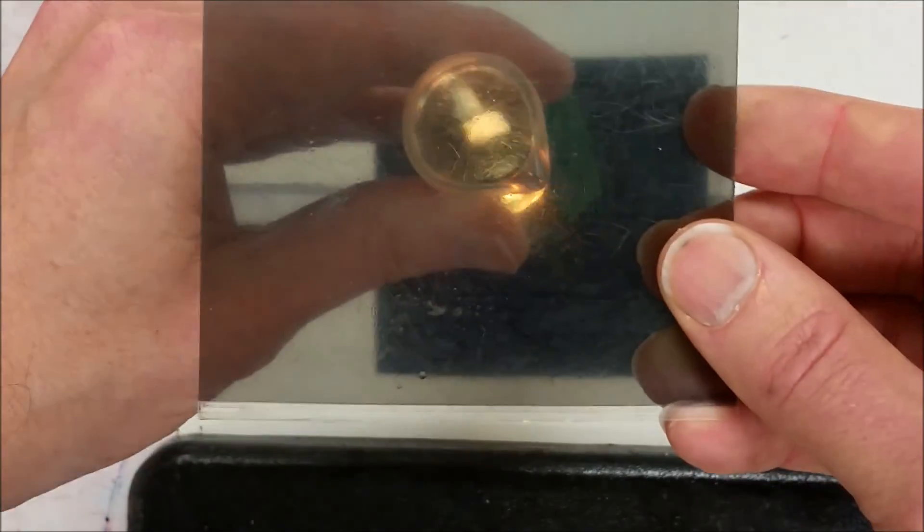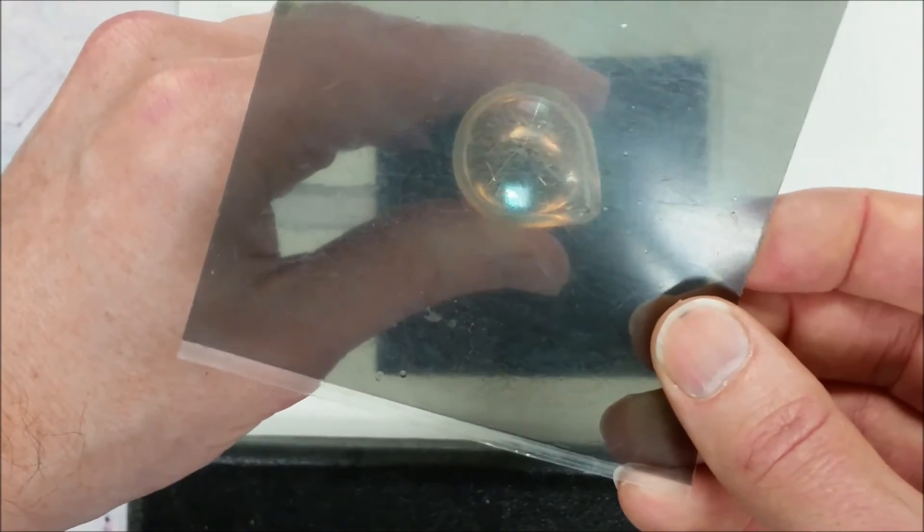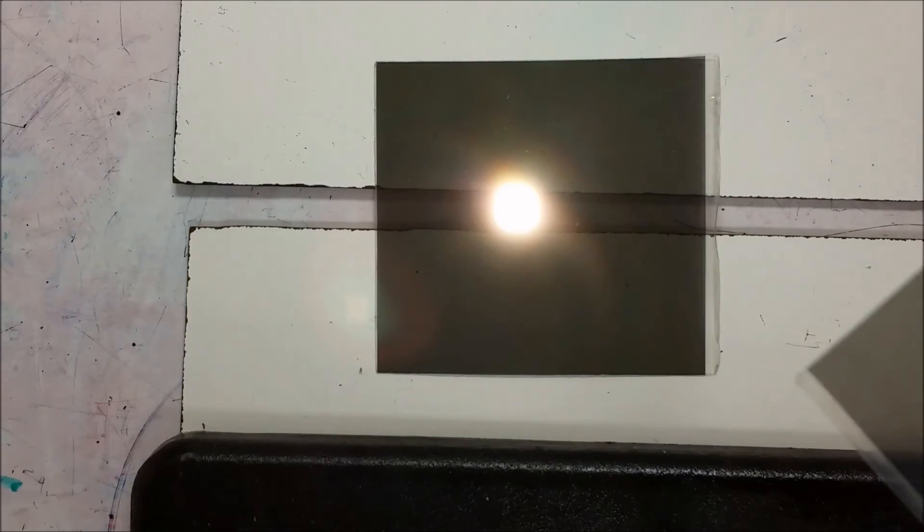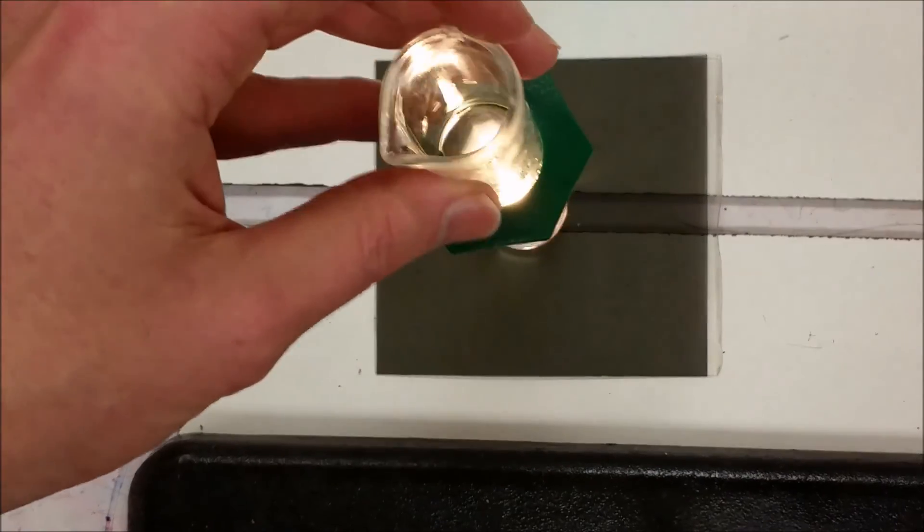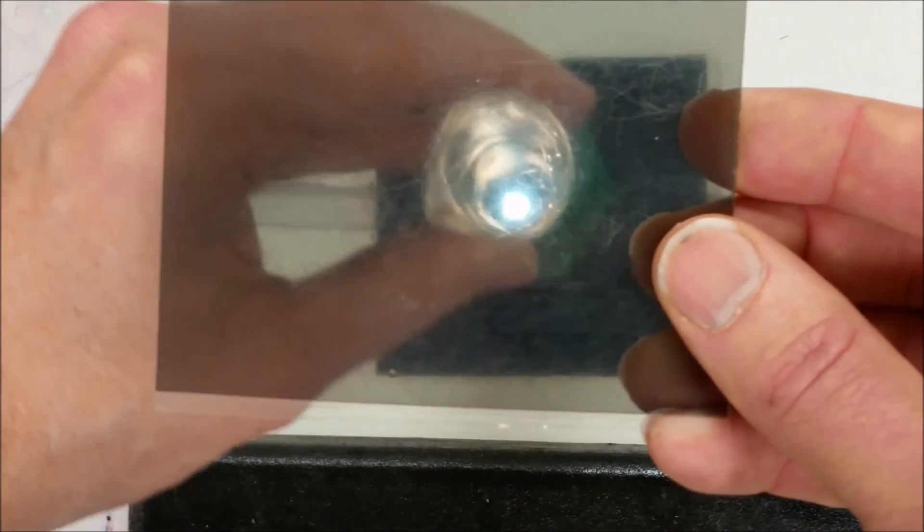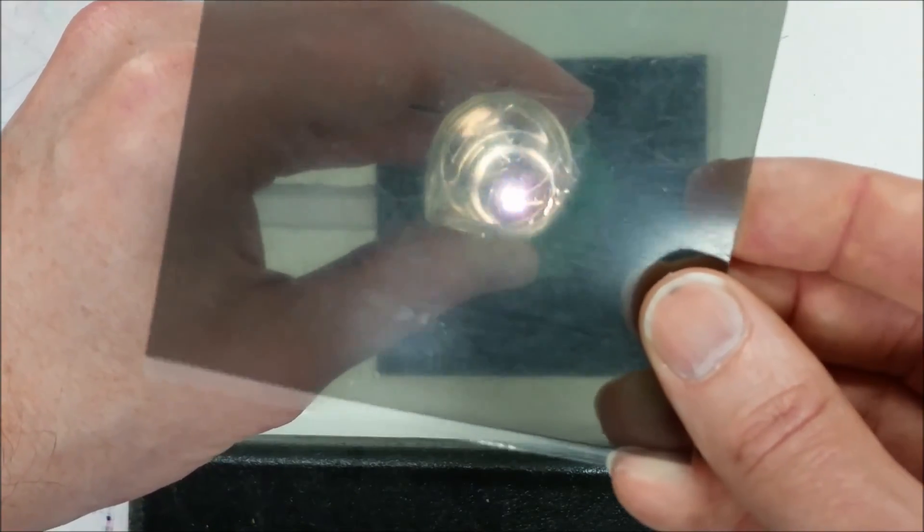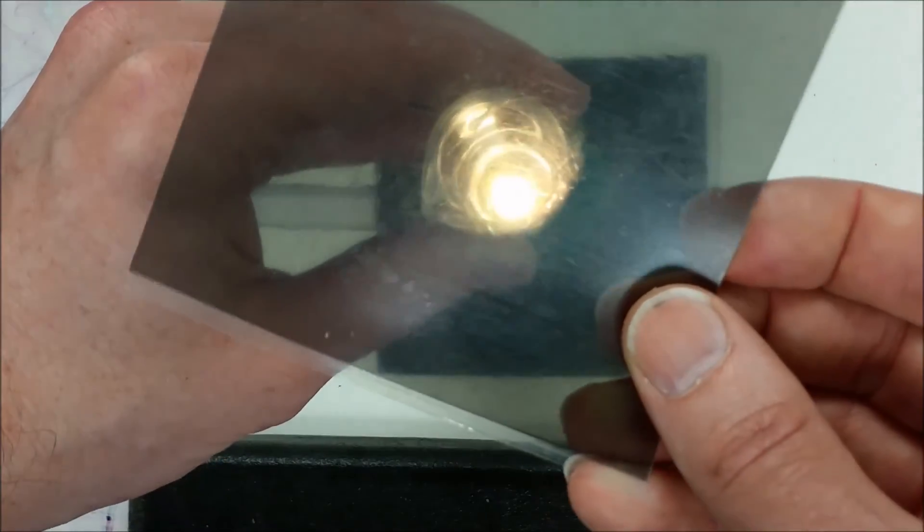As we go through and go from a concentrated solution to a less concentrated solution, that angle that we were required to change is going to become less and less. So if I put a 10 percent, we would expect to see, at the same height, a smaller rotation necessary. And so you can see that a smaller rotation gets me to the minimum, and then it starts to get brighter again.